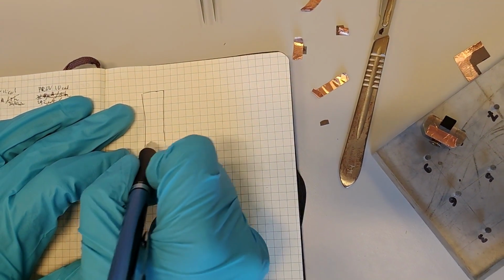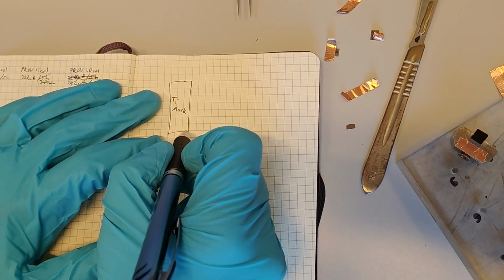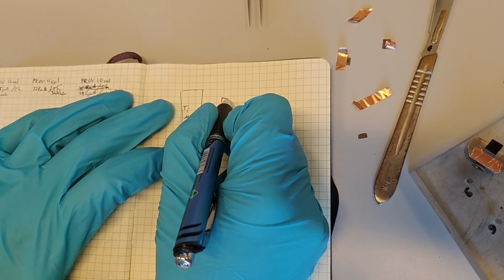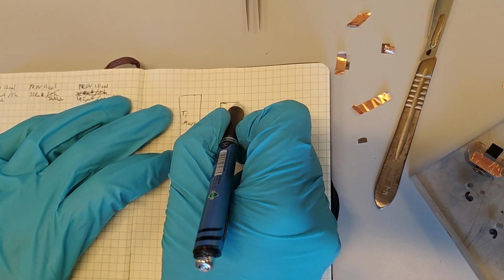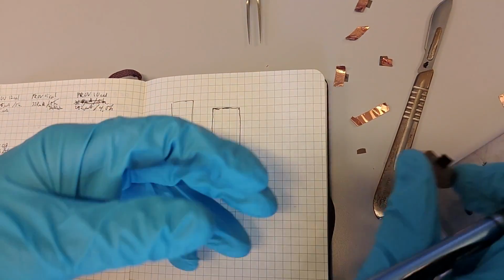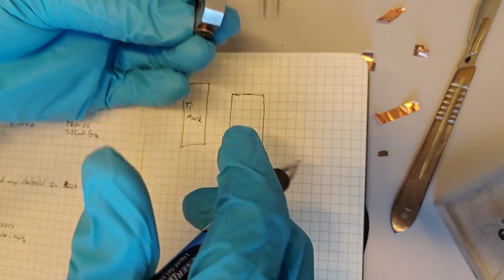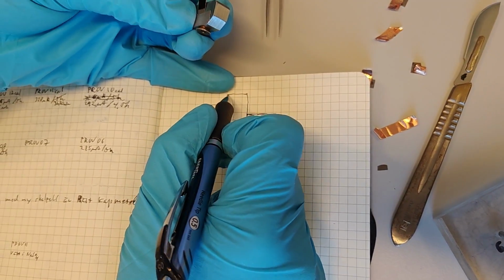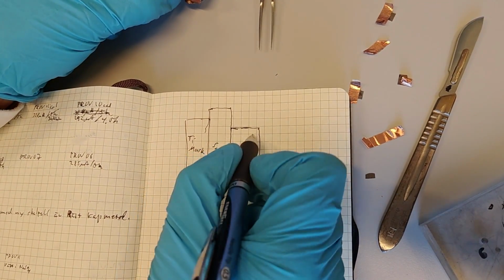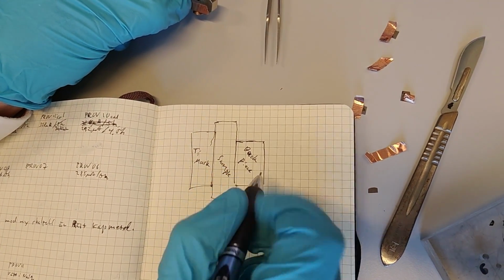So here is this titanium mask, right? Then our sample is mounted on this back support, and the back support, you can just draw it like this. So and here there is a screw on top there. So I'm drawing it in this direction now. So our sample is going to be clamped here between, right? So this is our sample. And this is the back piece. Right?